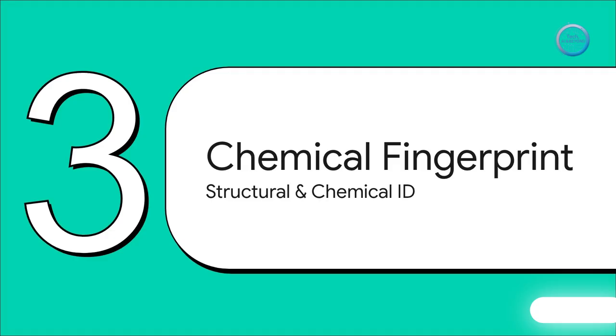Okay, so we can see them, feel them, and get these amazing images. But a picture doesn't tell you what something is actually made of. That brings us to our third section, uncovering the chemical fingerprint. How do scientists get past the image and figure out a material's chemical identity? This is a really important shift. We're moving from shape to composition.